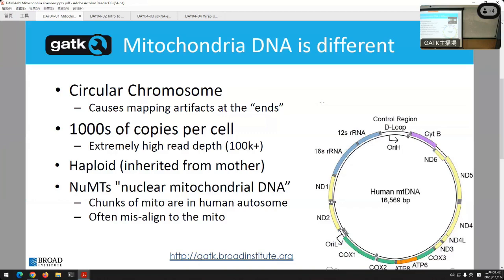What happens is, at some point in history, some cell had a really bad day. Something happened, it panicked, it's putting itself back together, it slurped in the mitochondrial DNA, and that's just part of you now. And to make it worse, the amount actually varies by population. Like other things, the exact amount of these NUMTs you have varies, so again, it can be a little hard to deal with. Because they're no longer in the mitochondria, being functional and producing useful proteins, they're decoupled from a lot of selection pressure. That means they get to acquire neat and wonderful mutations. There are no constraints. If they don't work, who cares? They're not even functional now.